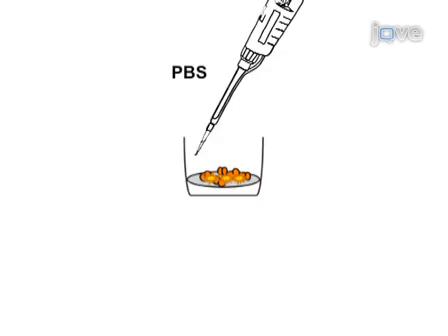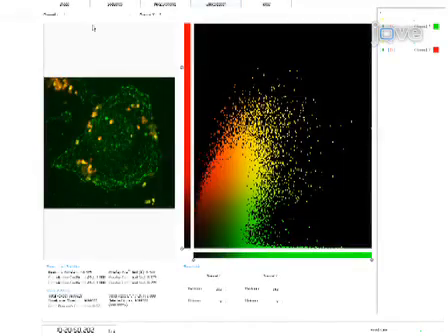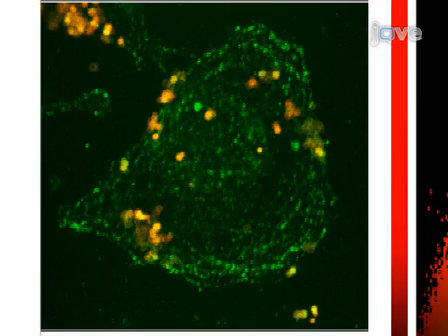As a second step, cells with intracellular bacteria are washed, fixed, and then permeabilized, which prepares the infected culture for immunostaining of internalized bacteria and intracellular α-actinin. Following the confocal imaging and application of co-localization software, images of the intracellular co-localization can be observed and quantified.